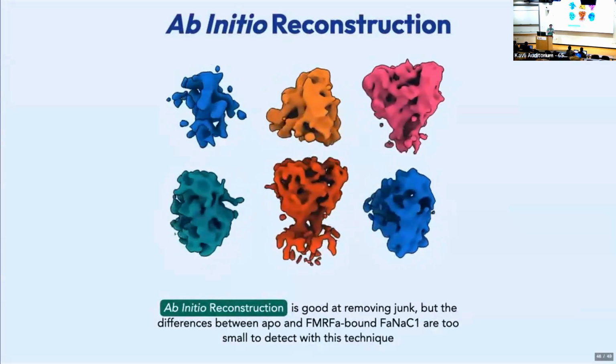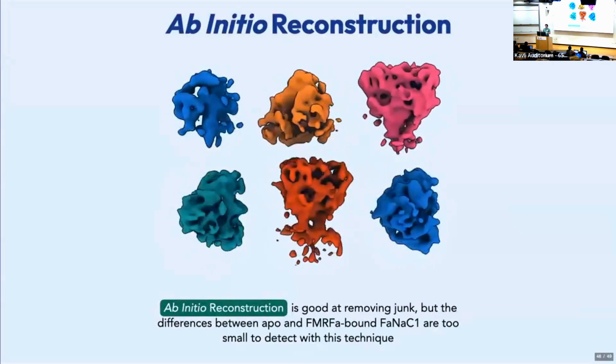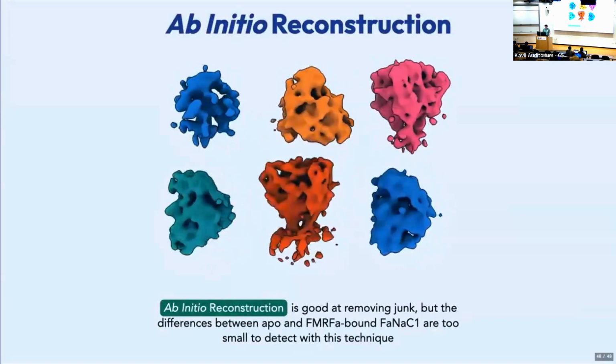I think of ab initio as you're just going as fast as you can to get something. Heterogeneous refinement is when you are a little more methodical and trying to separate out two things based on a small feature or a small set of features.